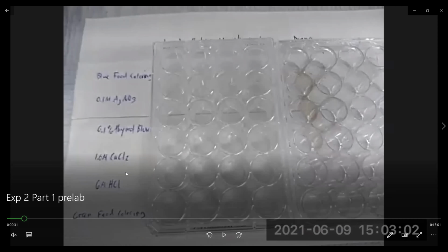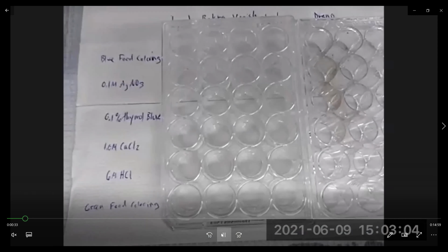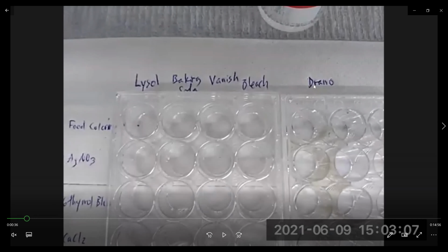So now what you see here is we're using cell well plates. On the left-hand side, we have our reagents. At the top, we have our household chemicals. So we set it up as so, and these are the household chemicals you'll be using: Lysol, baking soda, Vanish, and bleach. But for this experiment, just to show you how we do it, we'll be using Drano as our example.